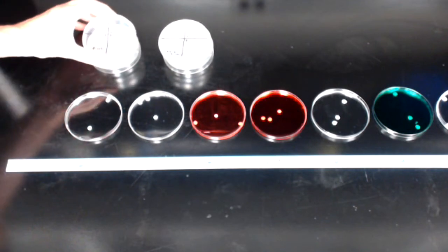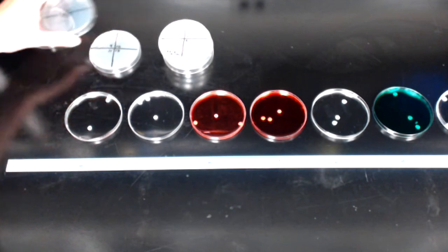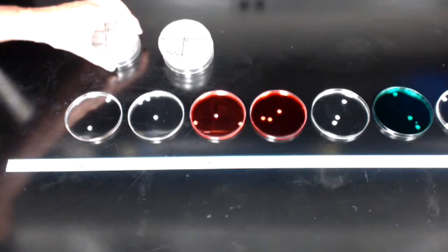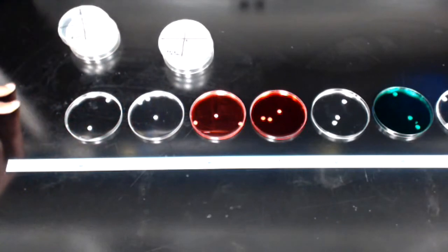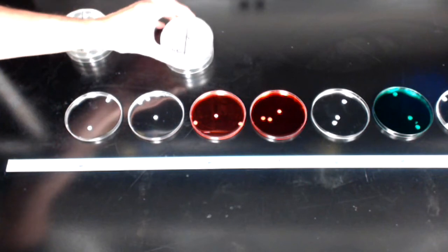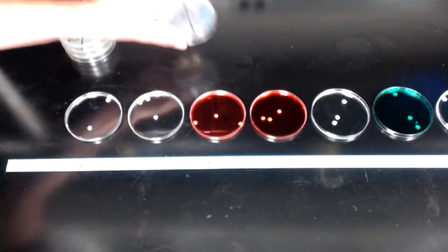I don't know if you'll be able to see it on the video camera. This is 1, 2, 3, and 4. This is 5, 6, 7, and 8. This is 9, 10, 11, and 12. I did the same thing for the Staph aureus plates. I numbered each quadrant with a different number from 1 through 12. This top plate from the Staph aureus stack, 1, 2, 3, 4, 5, 6, 7, 8, 9, 10, 11, 12.